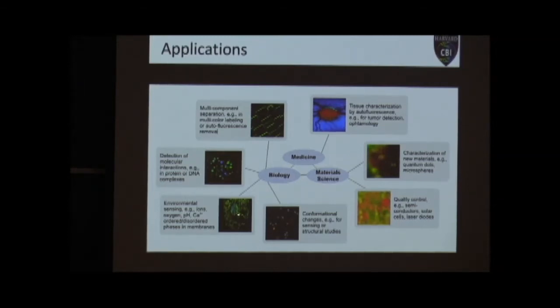But before I get into FRET, I will say this sometimes doesn't have to be done with FRET though. You can tag a GFP molecule onto your protein of interest, and sometimes, definitely not all the time, if that protein, let's say it's a kinase that goes through a conformational change when it's doing a phosphorylation step, that conformational change can actually affect the lifetime of the GFP molecule. It just depends on where it moves and what it comes into contact with during that process.